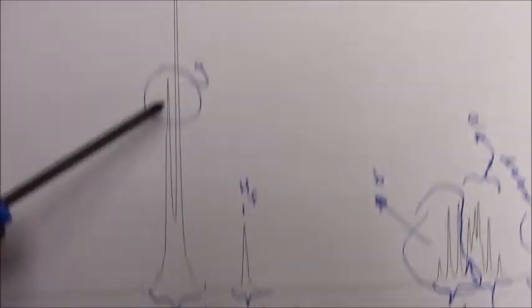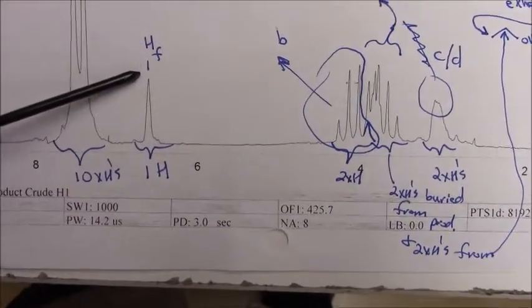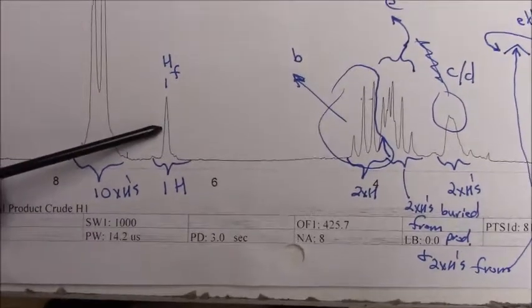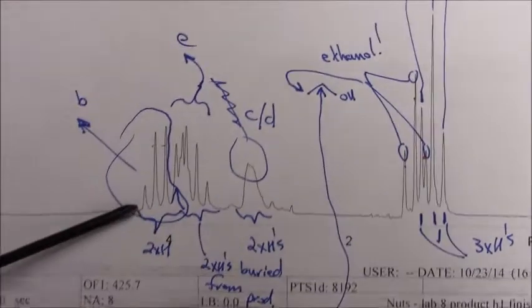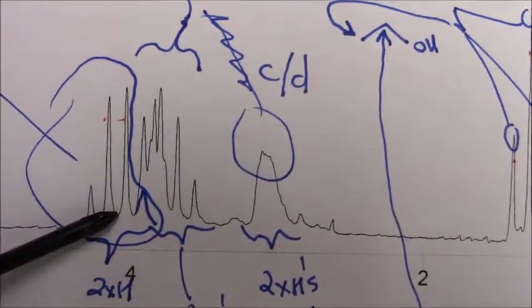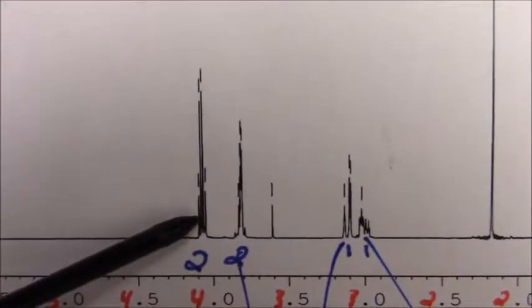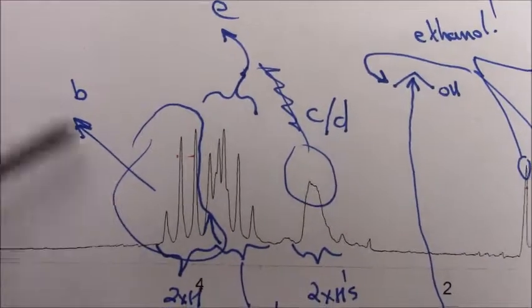It's already labeled 10 hydrogens. I've labeled it G. You can't tell them apart. HF, right, is that one, right at 6.6. I've circled what looks like a quartet. See how I've kind of traced what that quartet would look like? Because when you go to this 500 one, you see the quartet would be isolated and right there on its lonesome. But our 60 megahertz crunches them together a bit, so that was B.